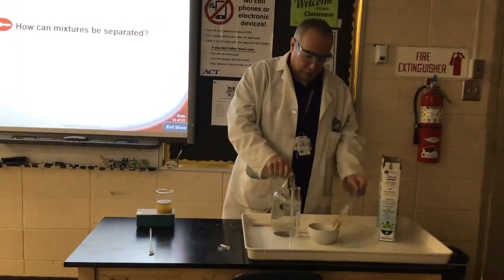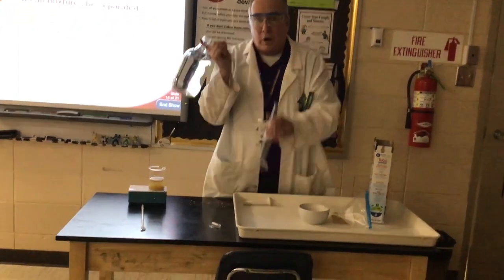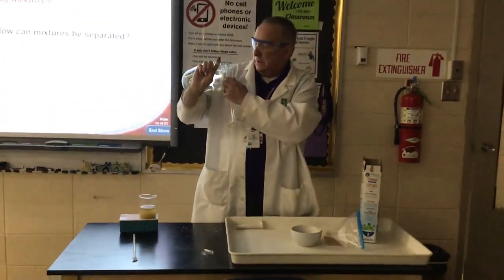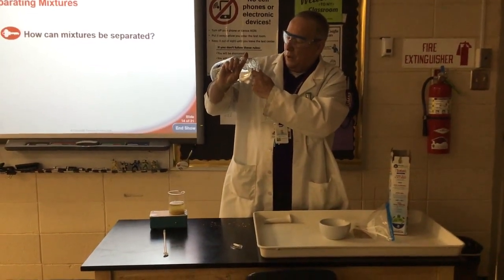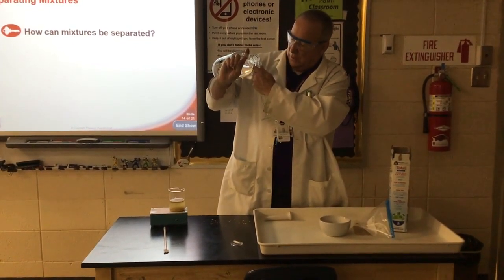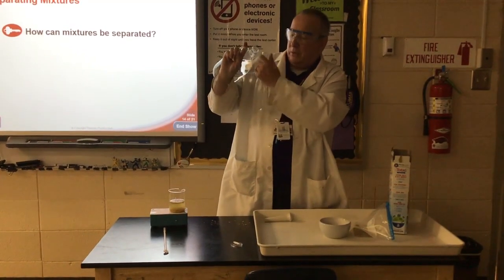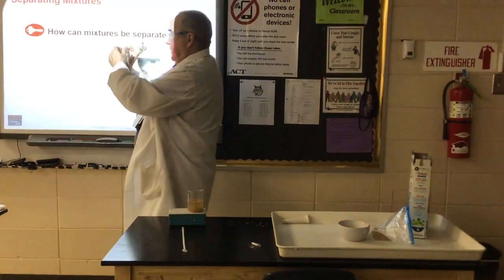And I'm going to measure out 100 milliliters of water from my water bottle of purified, distilled, deionized water, my glass bottle, and I'm going to get in the light so I can read my numbers better.